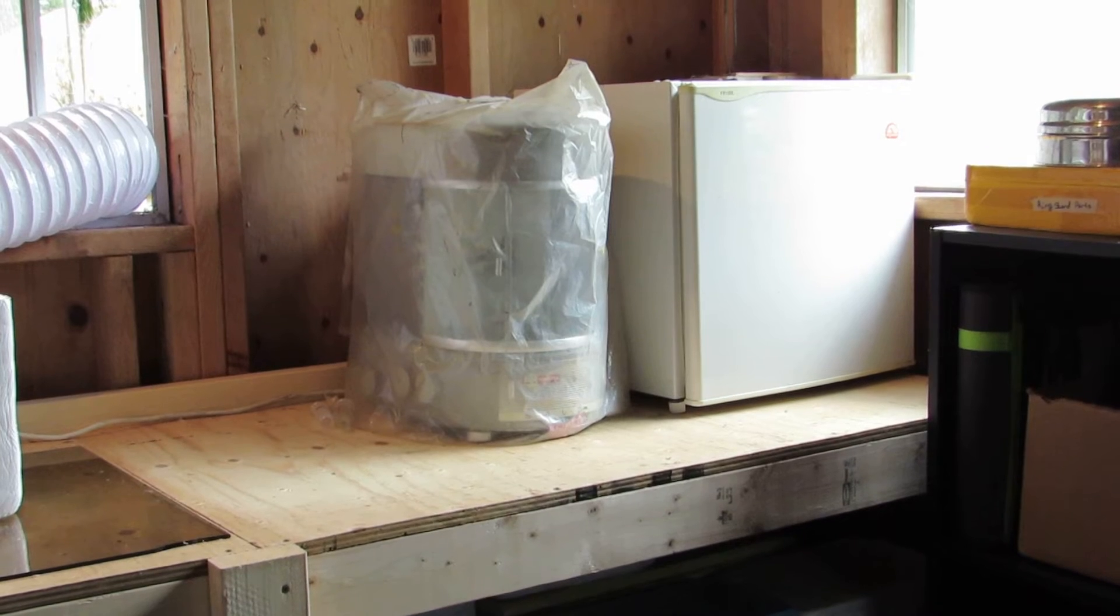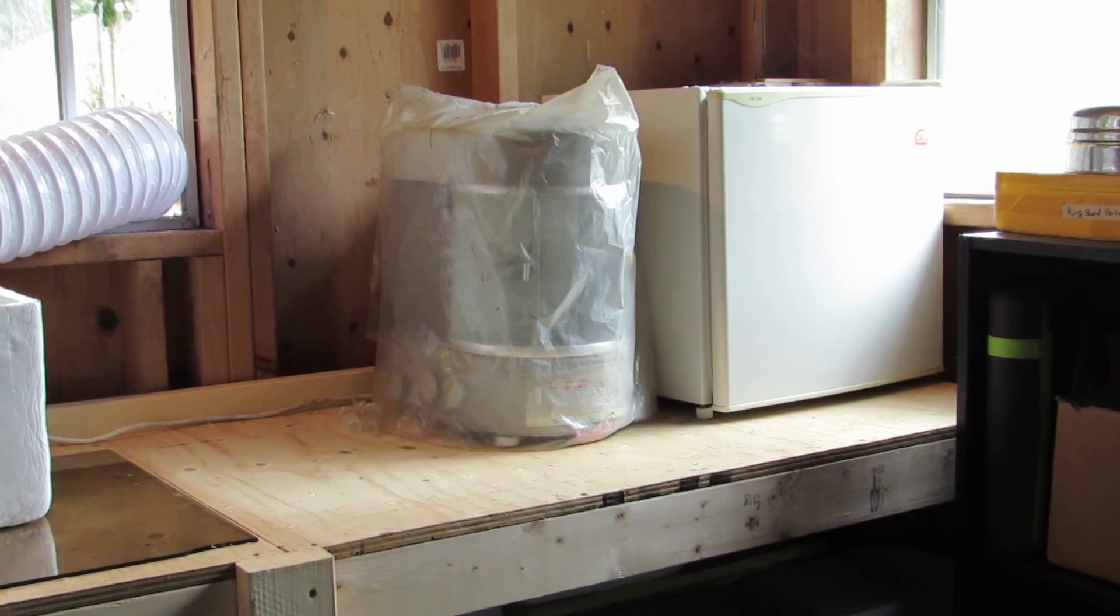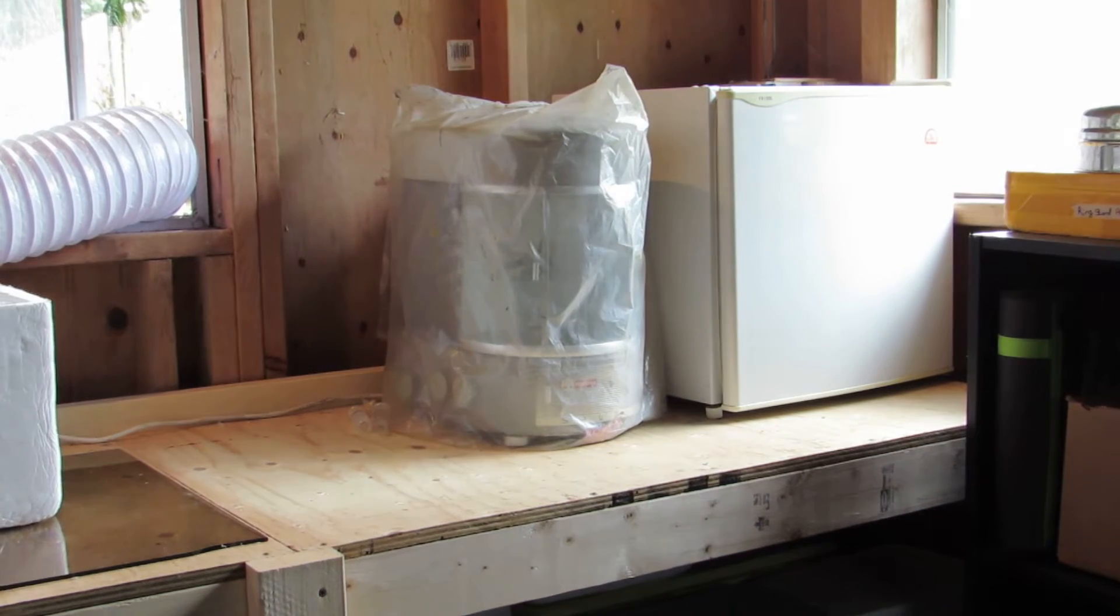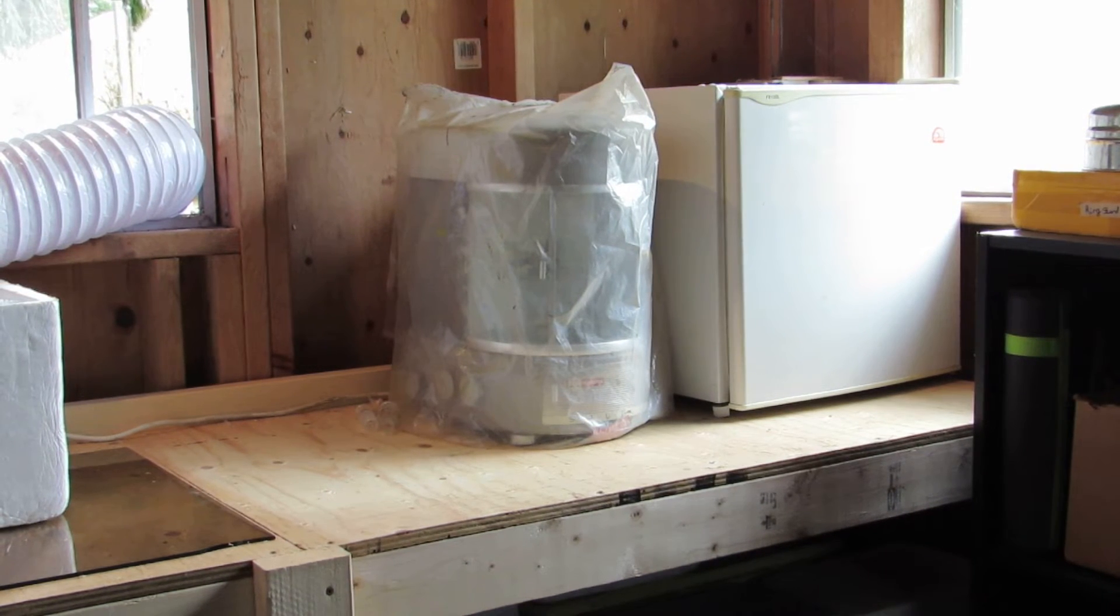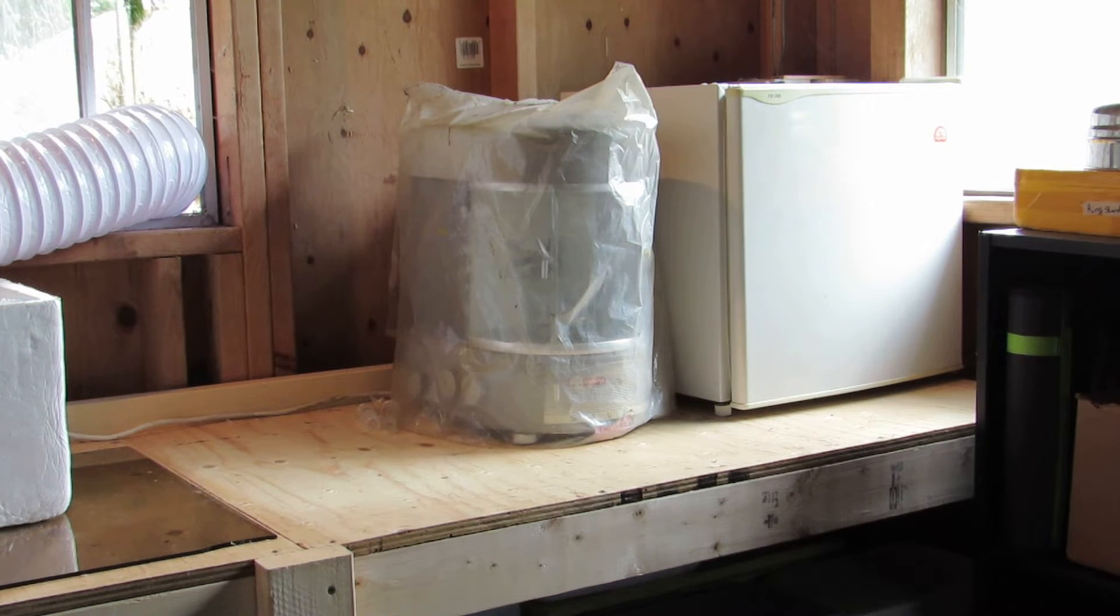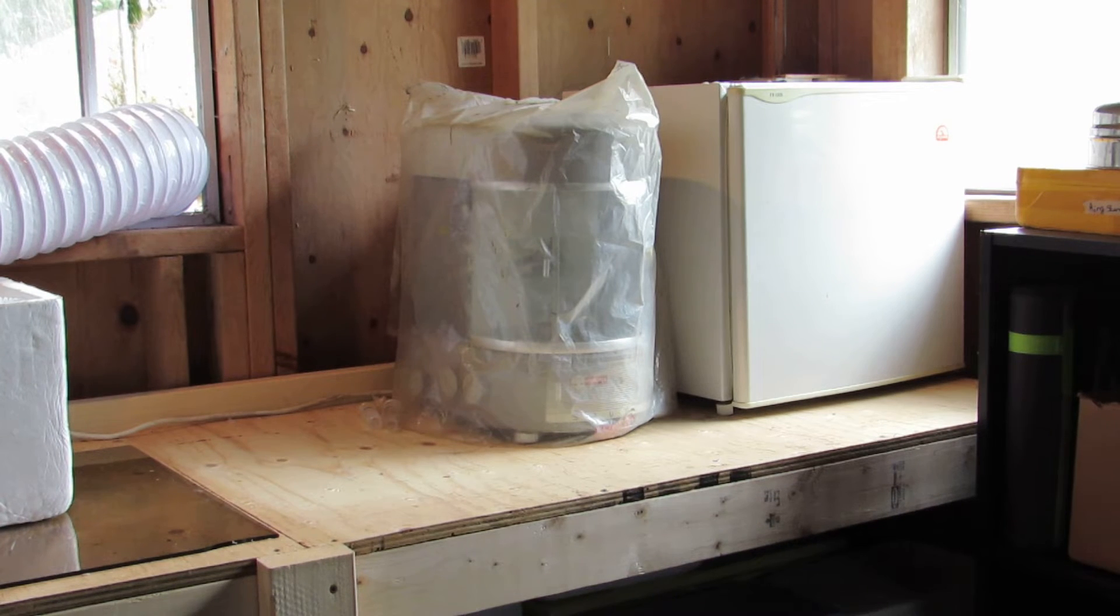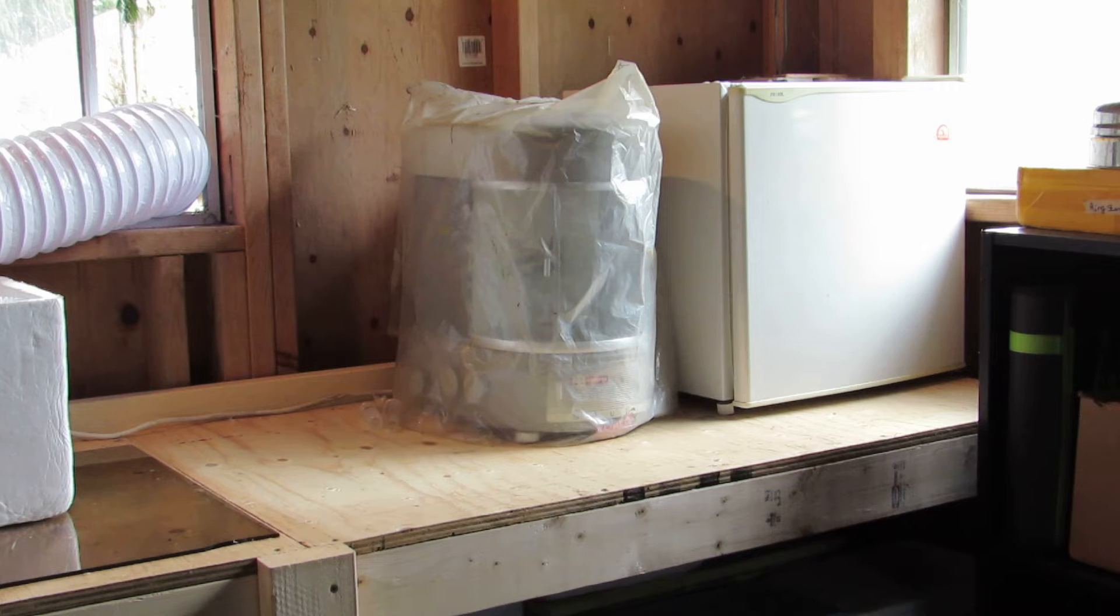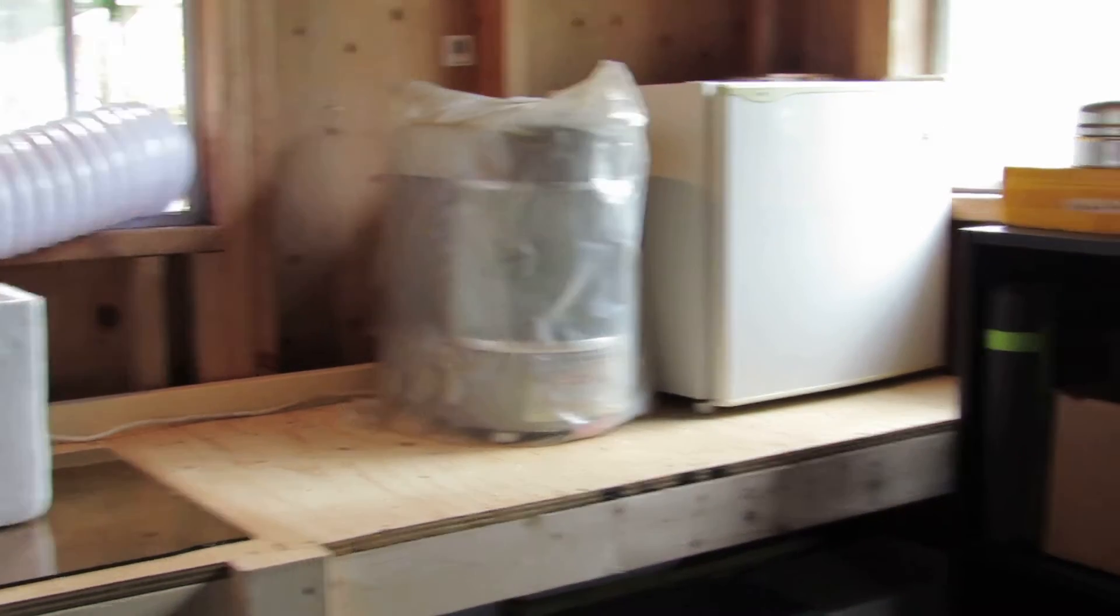And over here on this side I have a mini fridge for storing more volatile chemicals. And then here I also have a lab scale. This is actually an analog scale that my uncle gave me that he bought a long time ago and it's super cool. It's I believe accurate to four decimal places which is unbelievable. And it's not electronic at all which I think is pretty cool. I'm yet to set it up but maybe I'll do that in another project.